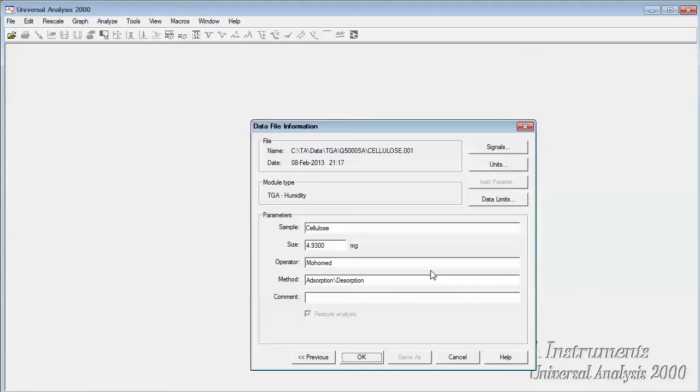In the data file information window, you will note sample name, sample size, operator, as well as methods and comments. Select OK.